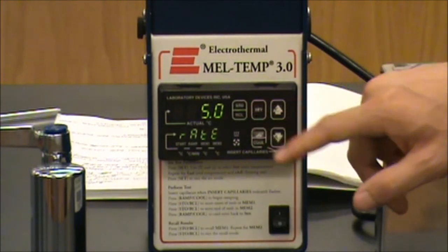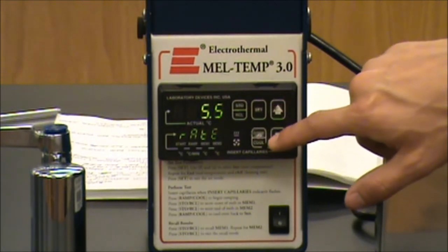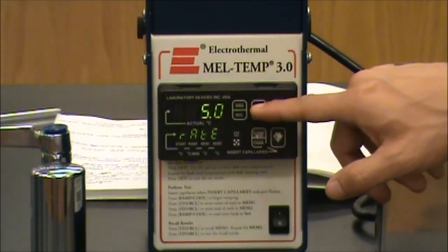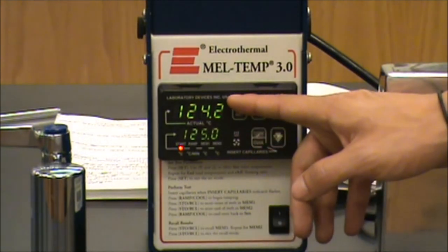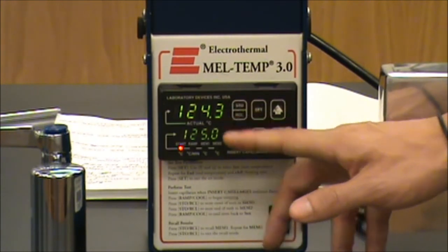If you hit the set button once again, it brings you to the ramp rate, which we can change using the up and down arrows. This controls the rate at which our temperature is going to increase. I currently have it set for 5 degrees a minute, which is the rate I suggest. Hitting the set button once more exits the programming menu. We can see our current temperature as well as our program temperature. Once these temperatures match, we are ready to begin.